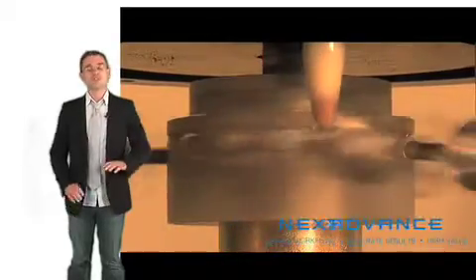The Bullet Blender uses patented striking technology to disrupt cell culture and break up even the toughest of tissue.